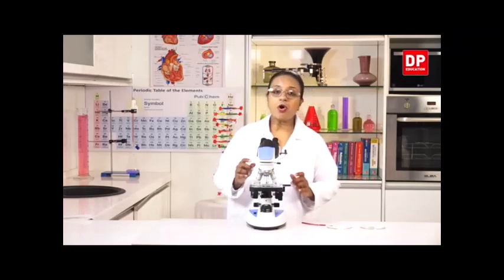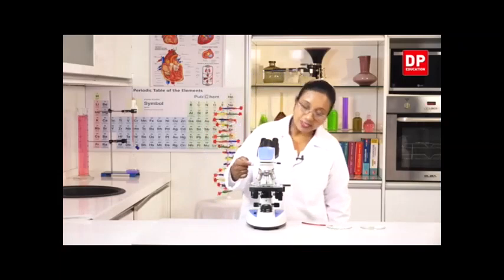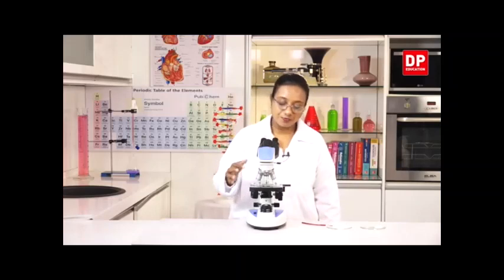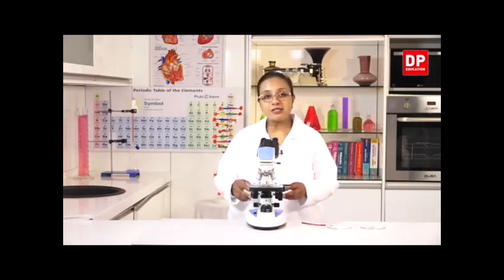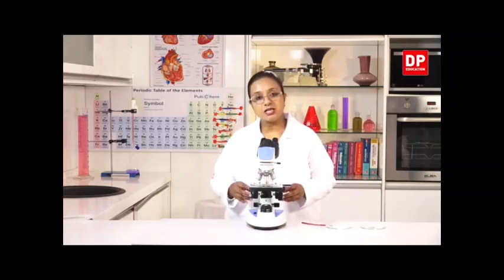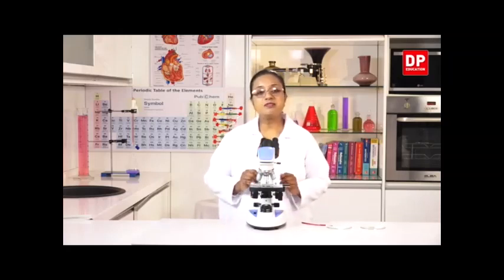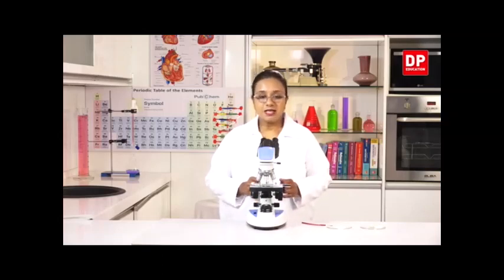Then I have to observe the sample using the lowest power. Lowest power can be easily identified, that has the shortest tube. And I have already selected the lowest power, and for that the adjustment is done using the coarse adjustment knob. So while I place my eyes and observe the specimen through the eyepieces, I can move the coarse adjustment and observe the specimen in the slide.